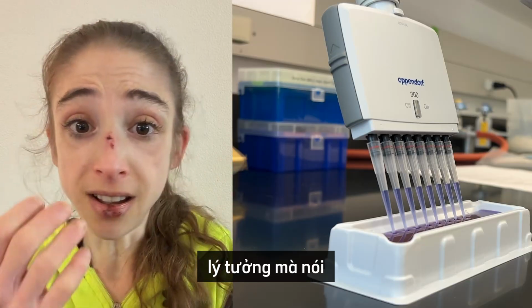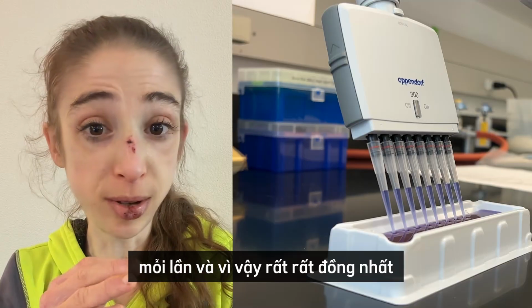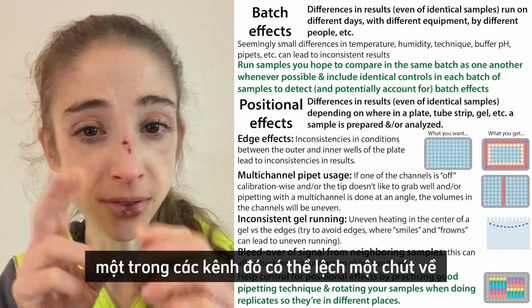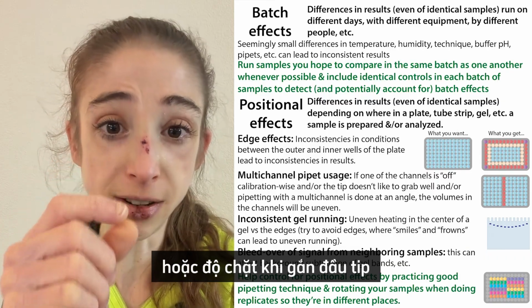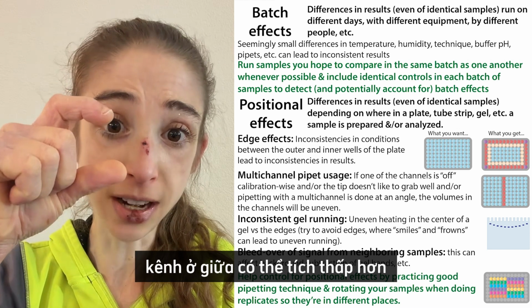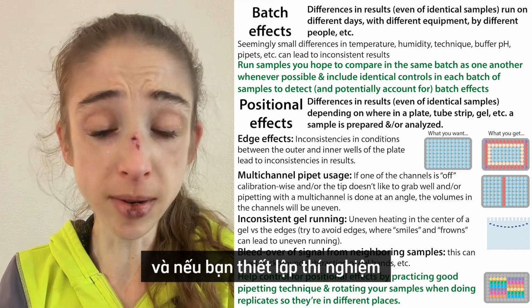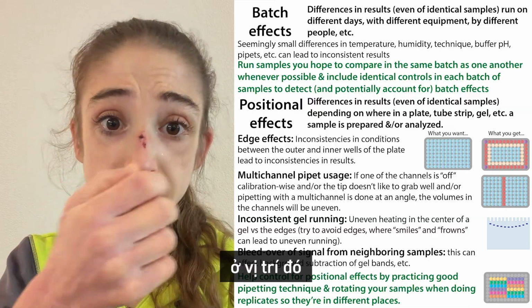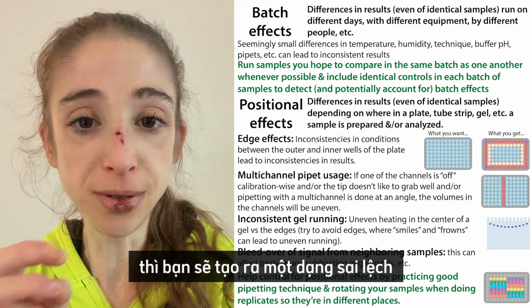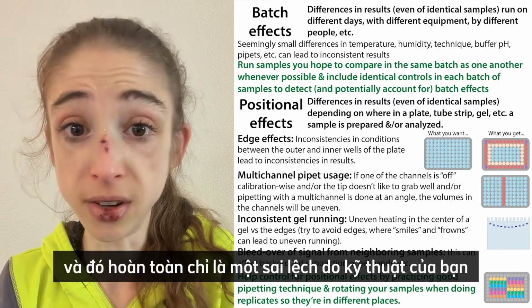Now, ideally, all those channels pull up the exact same amount of liquid every time, so it's super consistent. In reality, sometimes one of those channels might be a bit off in terms of its calibration or how tightly it grips the tip. And so you might consistently find that, say, the center channel has a lower volume than the outer channels. And if you set up your experiment so that you have the same sample in that position in all of your different replicates, then you're going to have a kind of bias at that one place, and that's totally just an artifact of your technique.